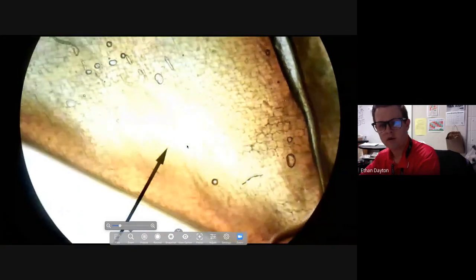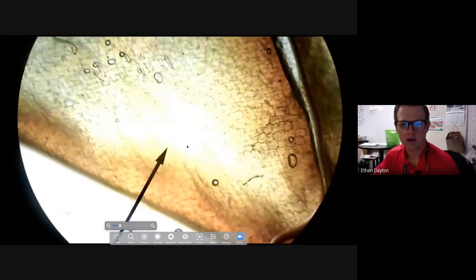Sorry, I know that's very bright. I'm working on making it not so bright. Come on.